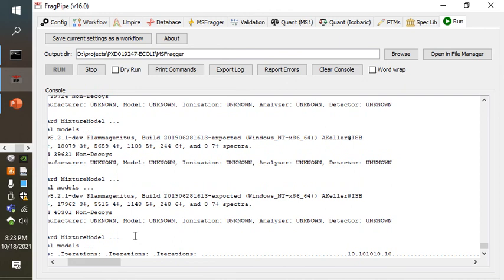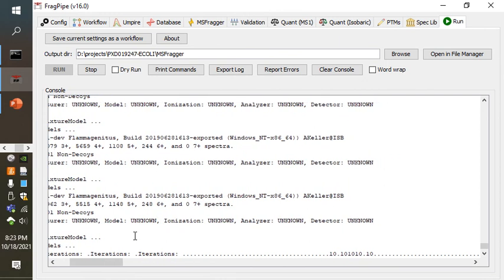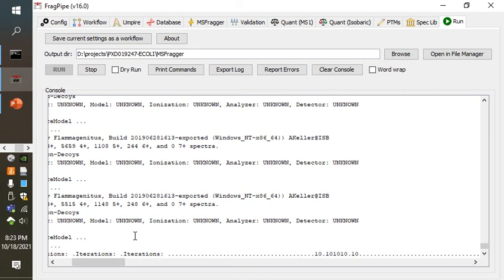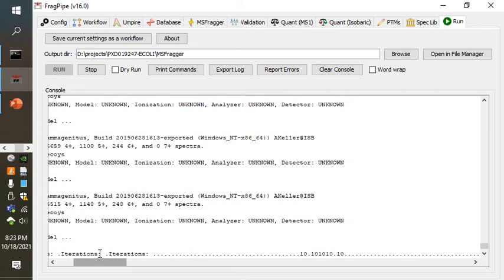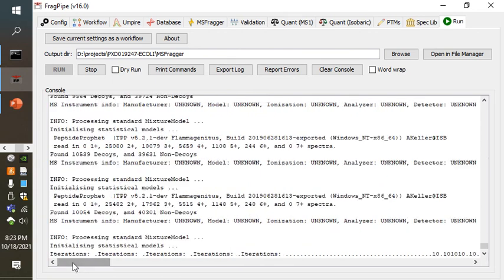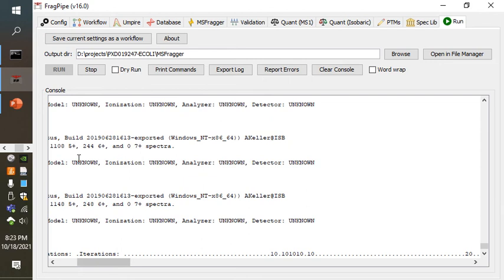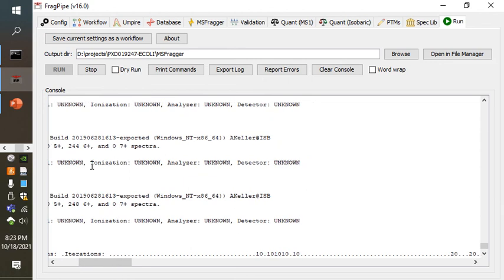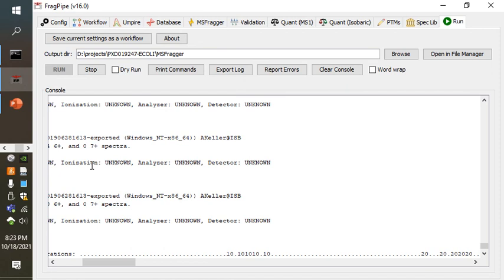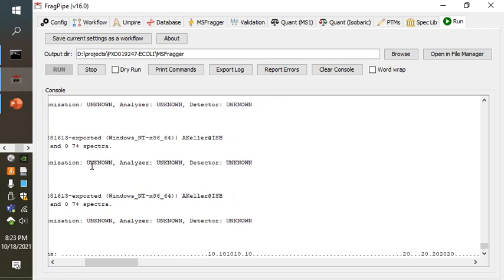This process of expectation maximization requires it to try lots of different random positionings of these distributions to find the best way to fit them. But I would note that even from the word go, I'm going to just try to hold the mouse to the left, but I'm going to fail here. We see that the number of decoys and targets that are found at each charge state is already showing that we have a larger number of matches to target sequences than we do decoys.